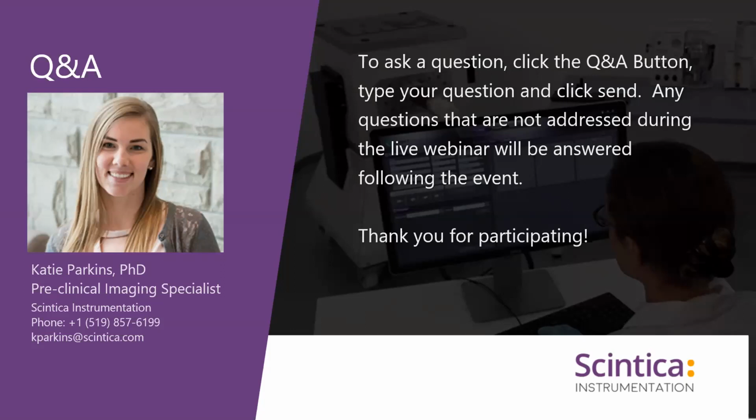Yeah, of course. It's definitely possible. There are many systems out there that have actually integrated these right into the system. Most of them already have both bioluminescence and fluorescence capabilities, but they have systems that are integrated with either X-ray or CT. And again, that's just a way to get both data sets within the same system.